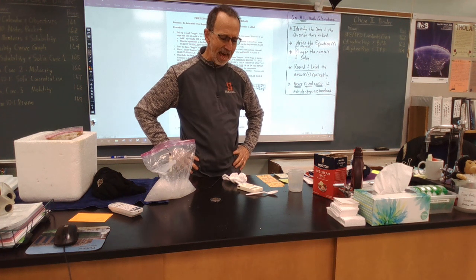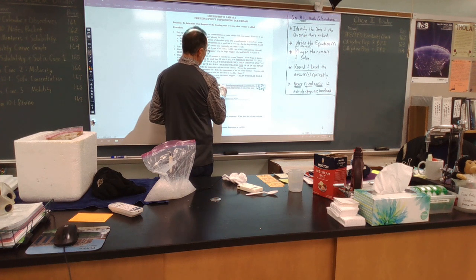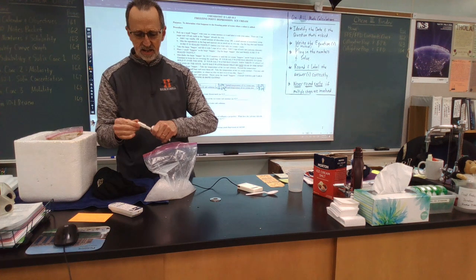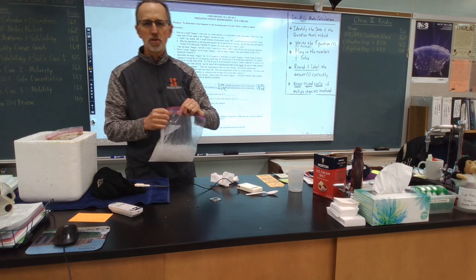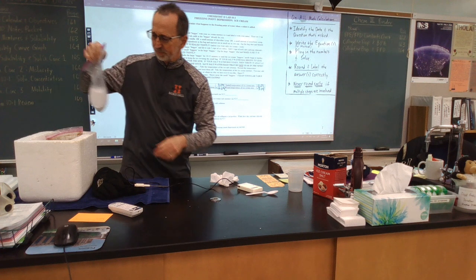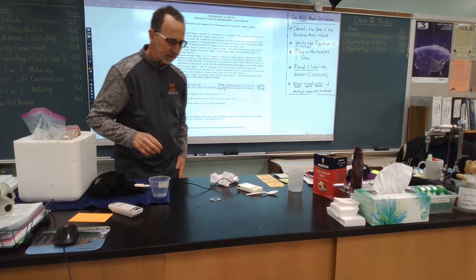Got down to about -12.5, but that's coming back up a little bit. Let's go -12. -12.0 degrees Celsius. So, here again, even though we have ice that's melting in there into liquid water, it is at a temperature that is actually 12 degrees colder than what pure ice normally is.